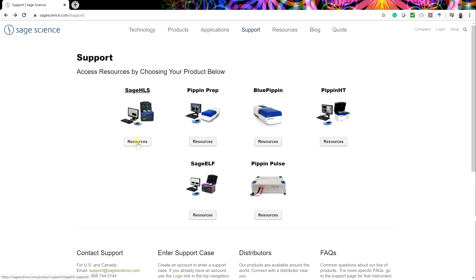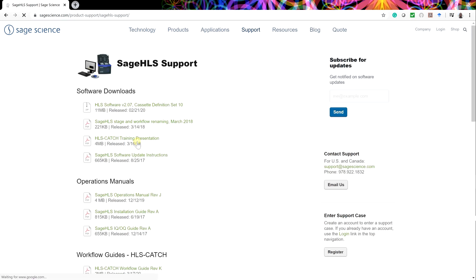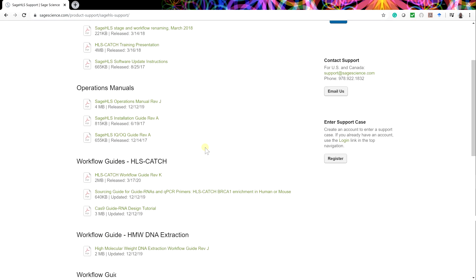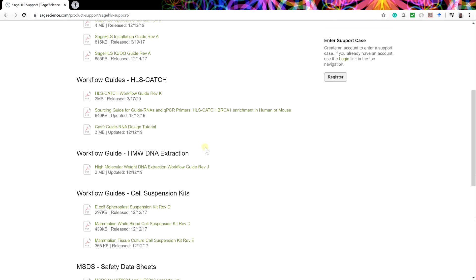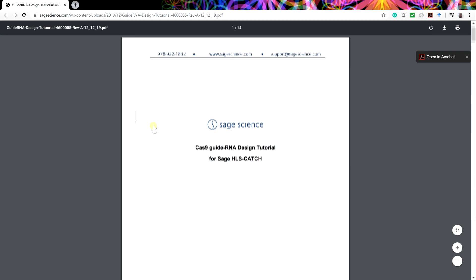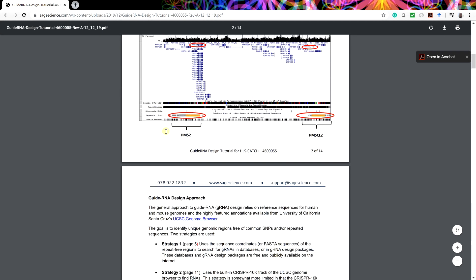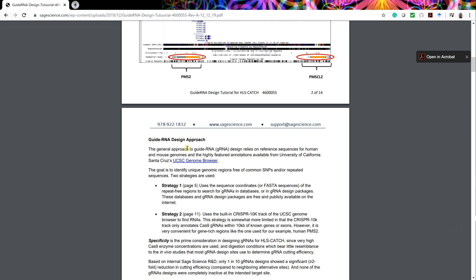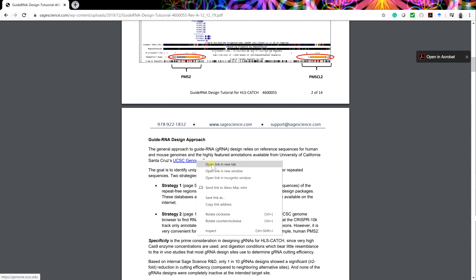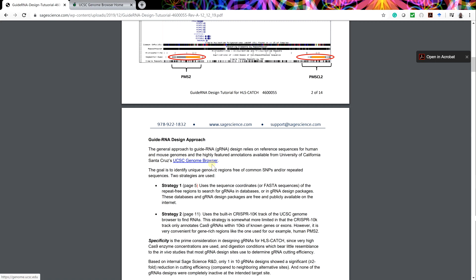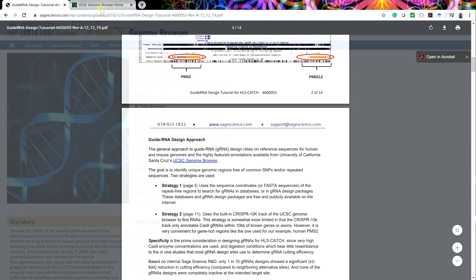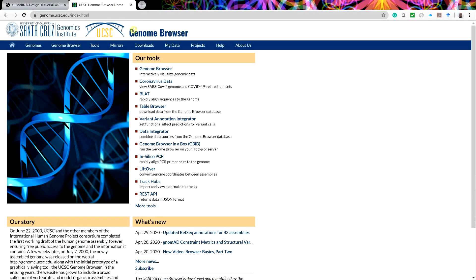A PDF version of this tutorial is available on Sage Sciences' SAGE HLS support page. A link to the UCSC genome browser and guidescan.com are in the document and can also be found in the summary section of this video below. To begin, launch the genome browser homepage.